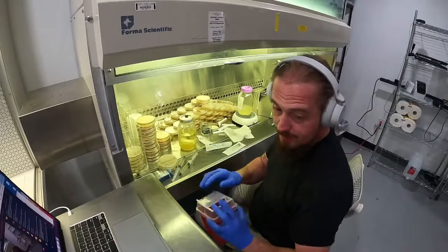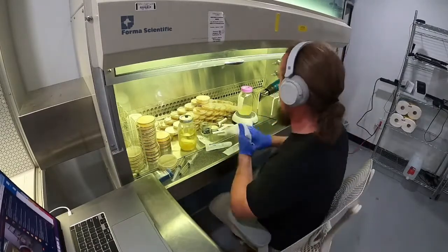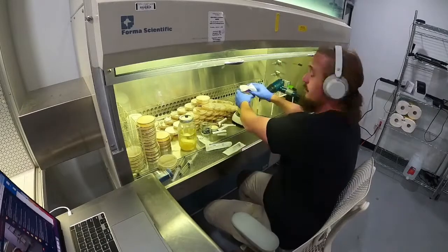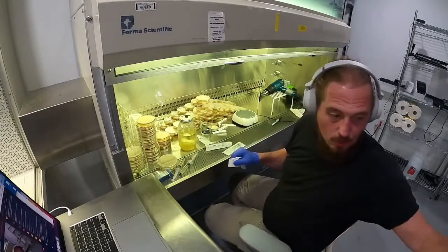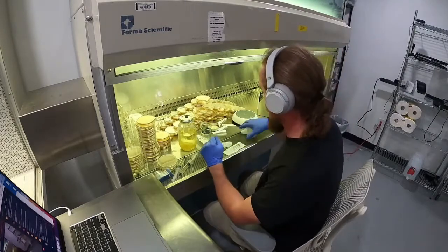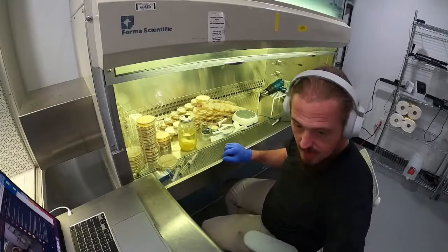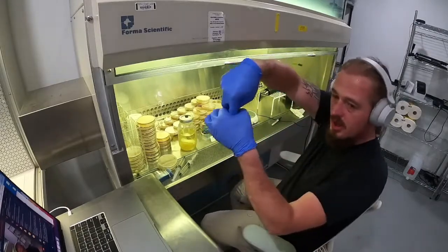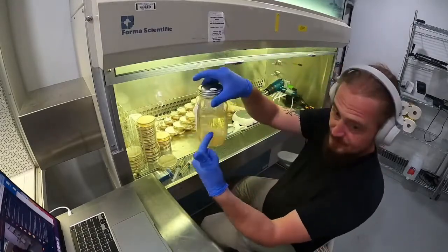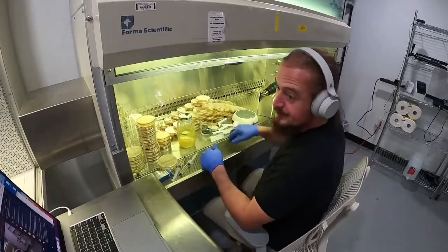As soon as I get a little bit of free money, I went through and designed a luer lock system with backflow control that I want to try out. What I'll end up doing is running the luer lock line into the bottom of the jar from here, and I can just luer lock extract here versus needles.